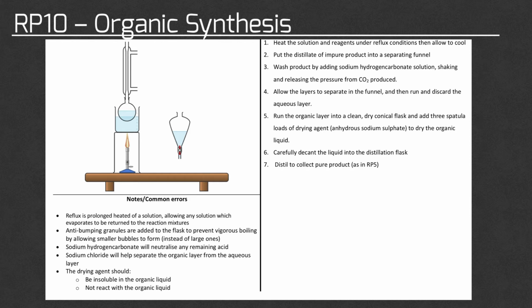We would then decant the liquid into a distillation flask. We would then distill to collect the pure product, just like we would do in Required Practical 5. Some notes on this practical: a reminder that reflux is a prolonged heating of a solution, allowing any solution which evaporates to be returned to the reaction mixture.